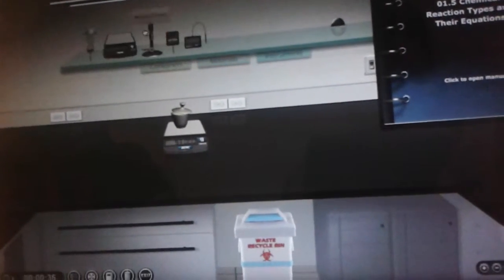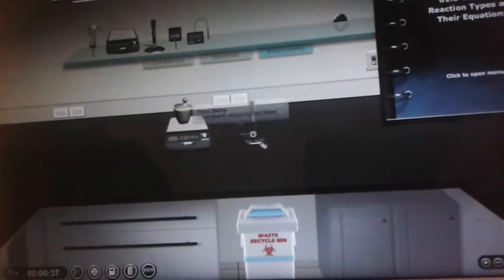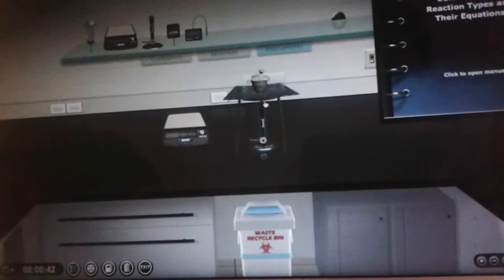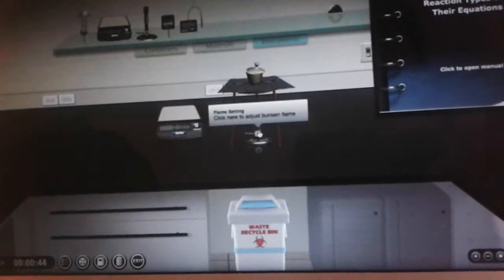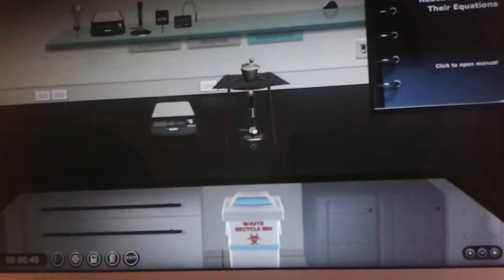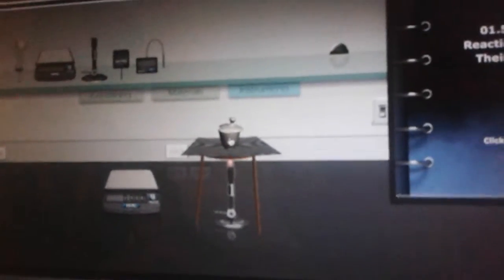We place the crucible and magnesium on a Bunsen burner, which we take out from the instrument section of Late Night Lab shelf. We turn the dial up once to low flame and let the crucible heat for a minute. So after about a minute, we take the crucible off the burner and let it cool down. We dispose the crucible inside the recycle bin.